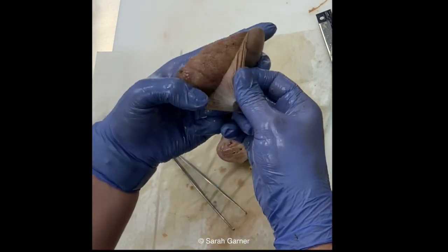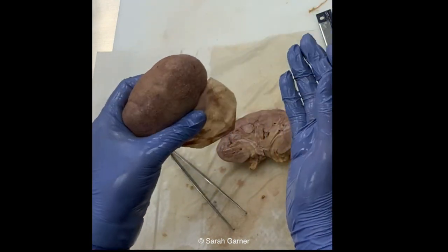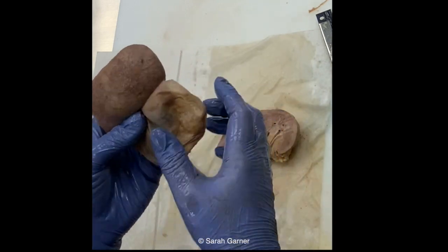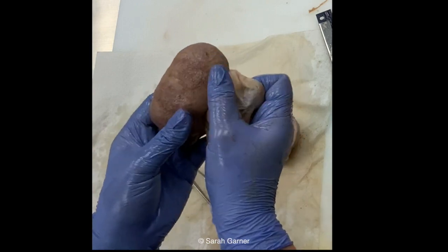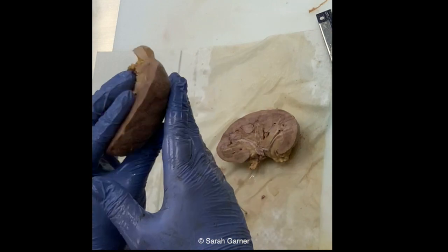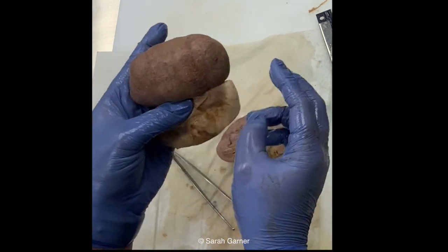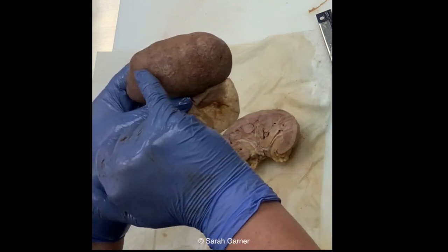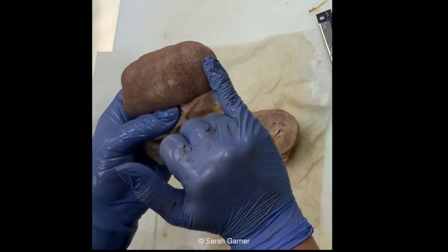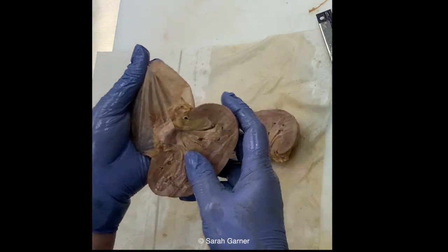So this is the renal capsule, right? And you're gonna peel that off, because you wanna note in your report whether it strips with ease or not. And you also wanna note what the actual outer surface looks like. So if it's hard to pull off, if it's hard to strip, that is probably indicative of hypertension or other issues. Same thing if you have a granular surface, kind of like we're having here. Sometimes it's called a flea bitten appearance. If it's a little bit atrophic and kind of almost lobular and has this granular appearance, that is more so indicative of hypertension.